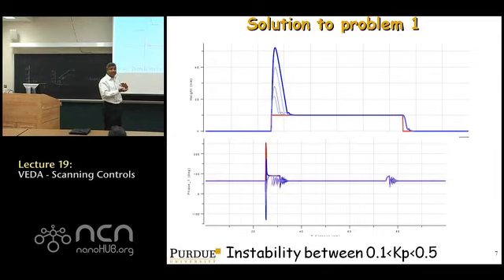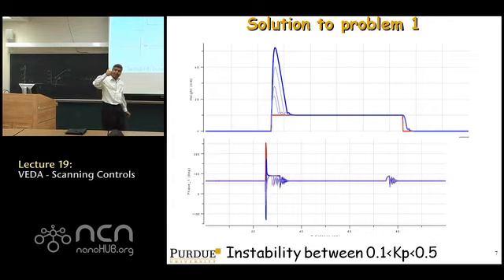The topography that is rendered in the image is the motion of the Z up and down to keep the amplitude constant. And so there's transients, the Z is moving up and down to try and get a steady state amplitude. All that transient motion comes into the topography. And so you would see the topography on the left-hand side is like you see higher heights when you approach a sample, so to speak.